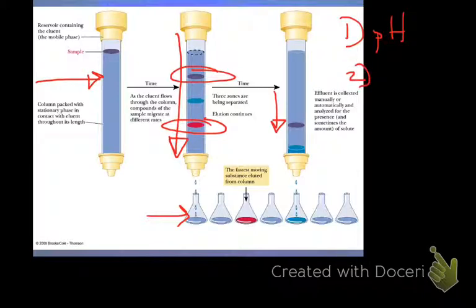Another one that's probably used the most is ionic strength, which is a really fancy way of saying, what are you adding? That's supposed to be an A, so it just ran off the screen.